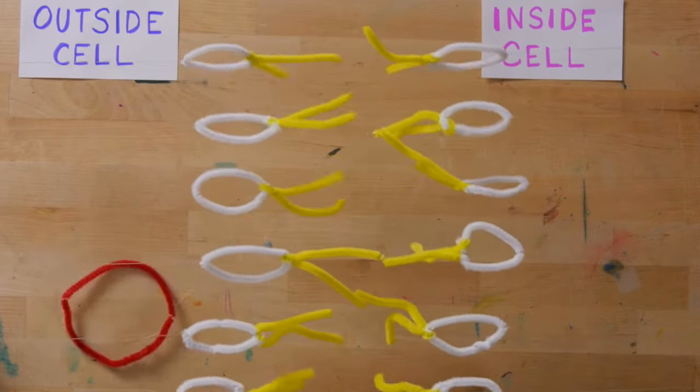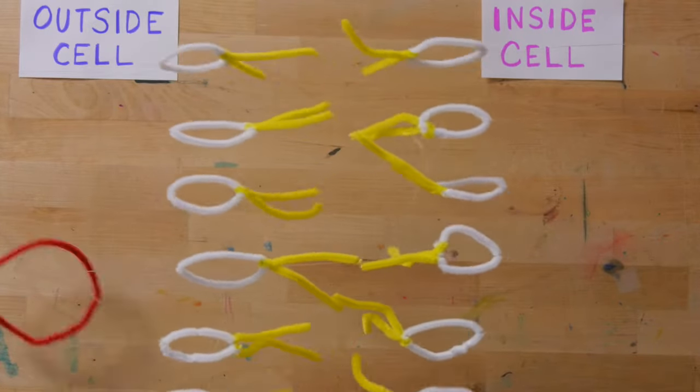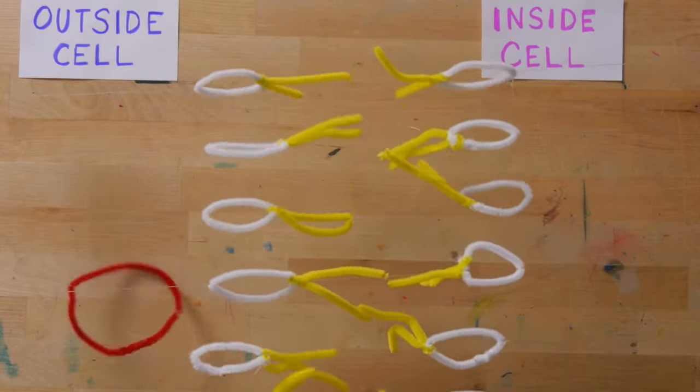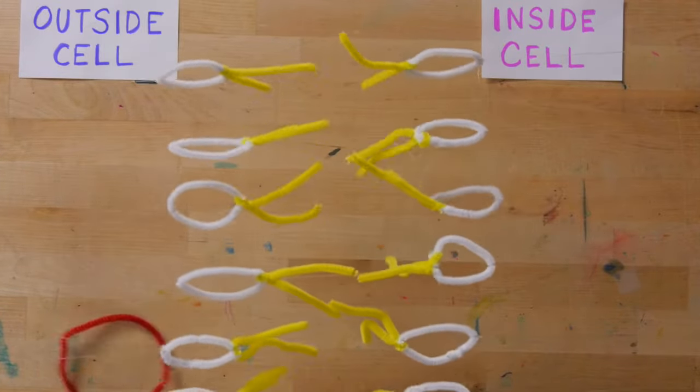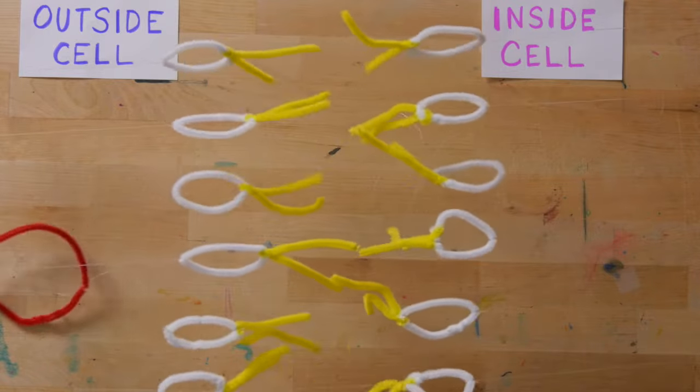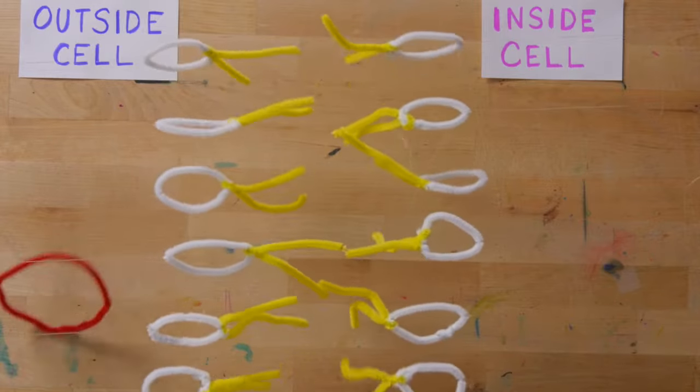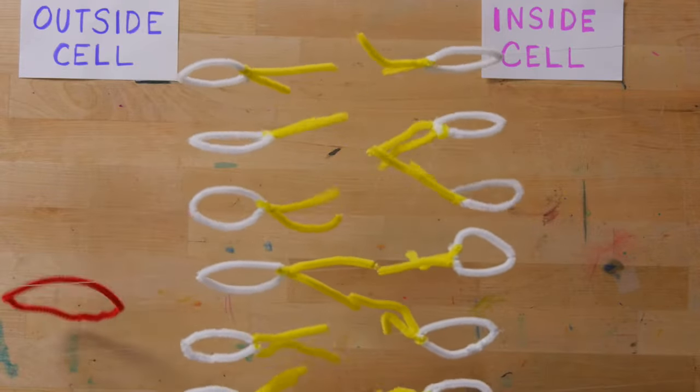After we've neutralized the charge of the phospholipids, we also have to worry about how they actually get past the small little gaps in between each of the phospholipids. When we store these cells, after we busted open the cell wall, we store them on ice because the cells have the ability to repair the damage to the cell wall.